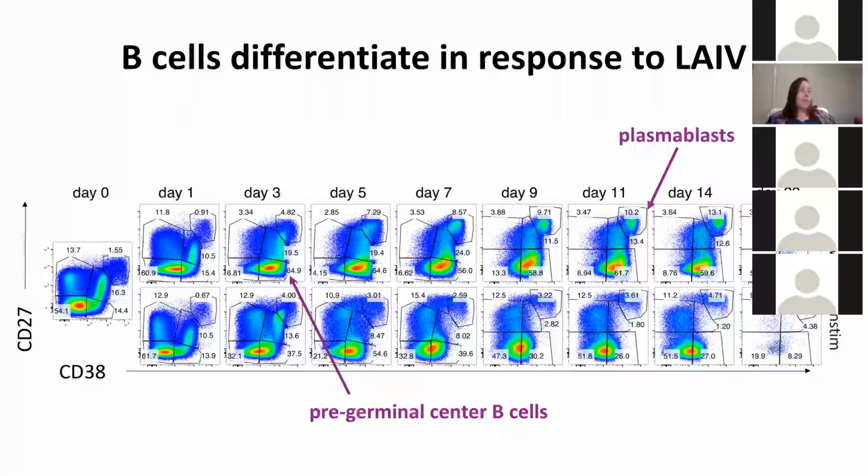A feature of these organoids is that we can actually make replicate cultures and harvest them longitudinally to be able to understand how the responses are changing over time and with stimulation. So for example, I'm showing you just one donor here with serial collections on different days, and then assessing the total B cells by phenotype with CD27 and CD38 expression, which broadly help us characterize B cells into different cell subsets, including naive, pre-germinal center, germinal center, plasmablast, and memory phenotypes.